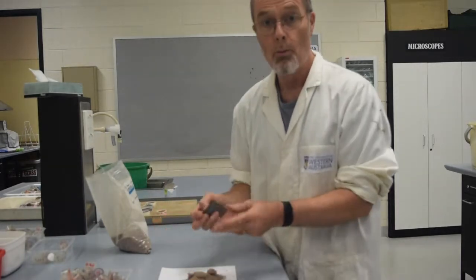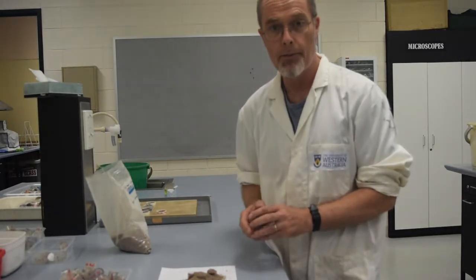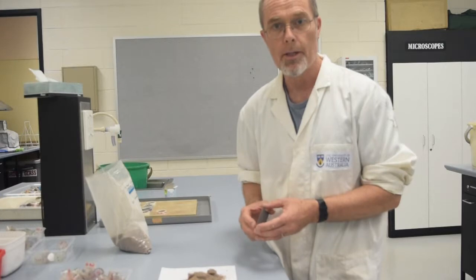Once we've got them all leveled off, we weigh them again, record the total weight, and then we can calculate the average weight of soil in each vial. And we know the volume so that we can calculate the density.